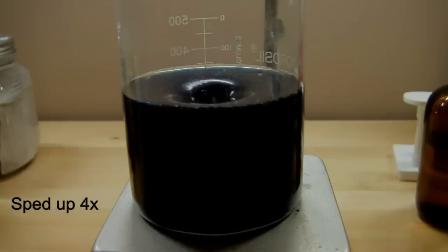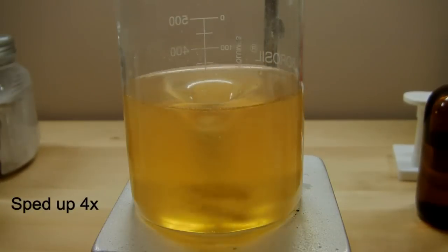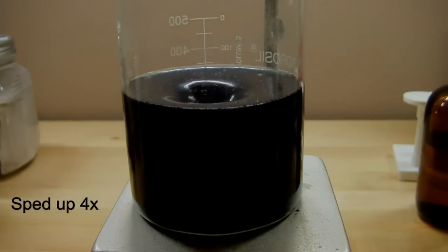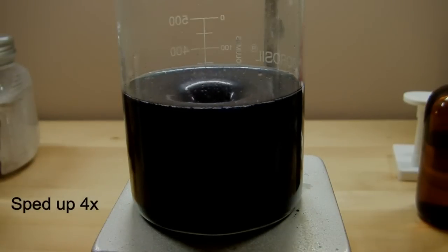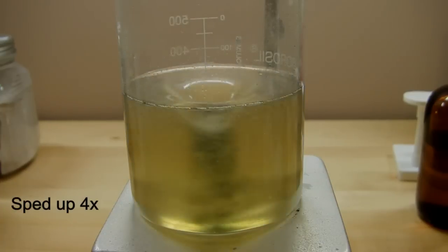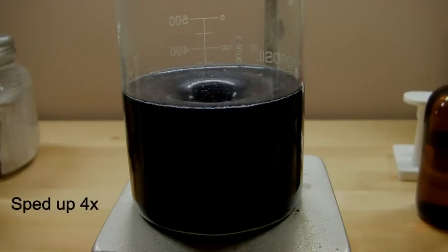This hypoiodous acid participates in other reactions that transform it to the iodide ion, I minus, and free elemental iodine, I2. The amber color is caused by this free iodine in solution. When the concentration of iodide becomes greater than the concentration of HOI, the iodide can combine with the iodine to form the triiodide ion which then complexes with the starch and causes that sudden change in color to the dark blue.